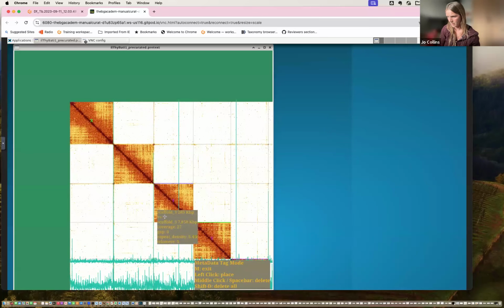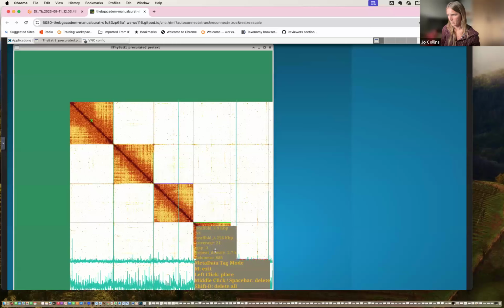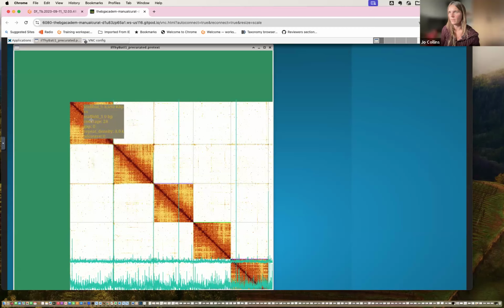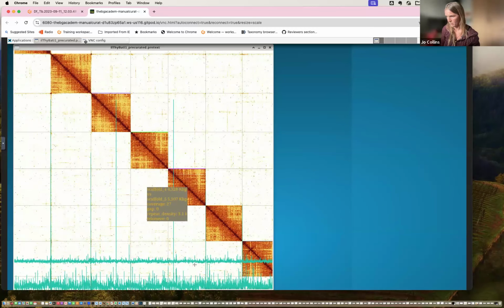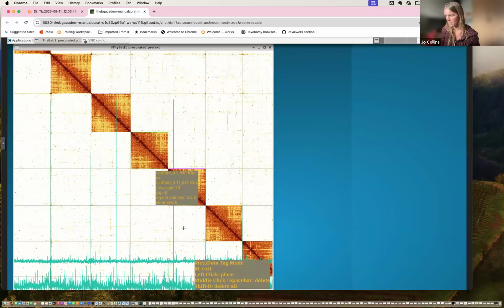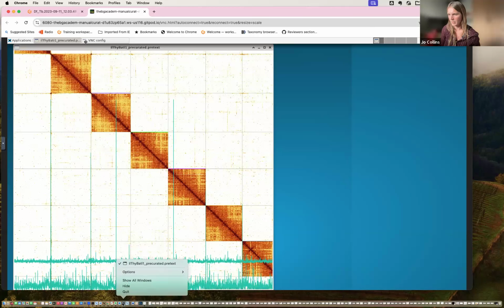Sorry, everybody. One second. Pressing M again. It's not showing me. I'm going to show you what you should be seeing.